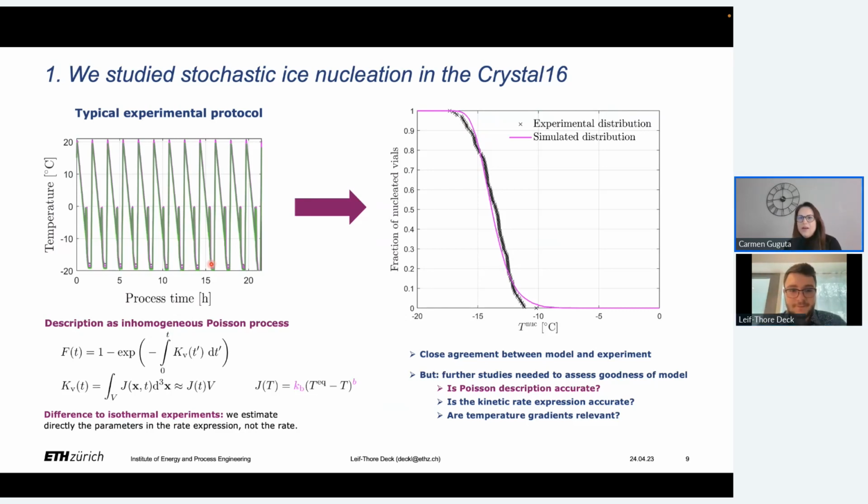And because you were talking about also the cooling rate, what is the cooling rate that you have used? Of course, again, versus crystallization, as you said, when you heat up and then you cool, it's different. But what did you use here? So we tested actually a couple of different cooling rates, and the reason for this was the issue with the temperature gradient. So in the end, the cooling rate that we mostly use is 0.6 Kelvin per minute, because we've realized there that gradients don't yet have a big effect, but we already have a good throughput.